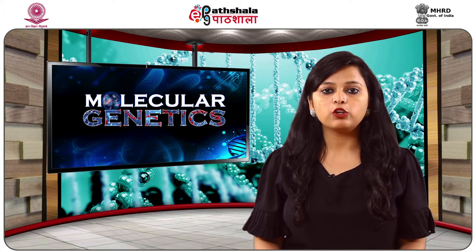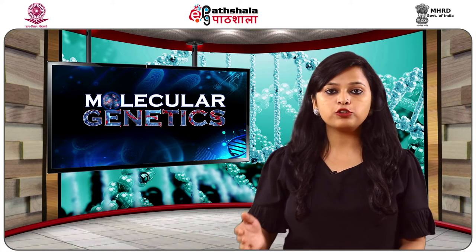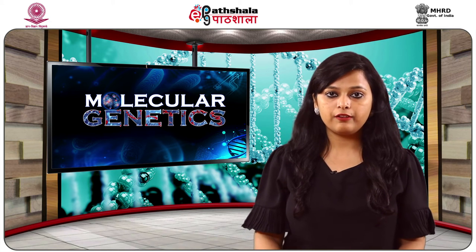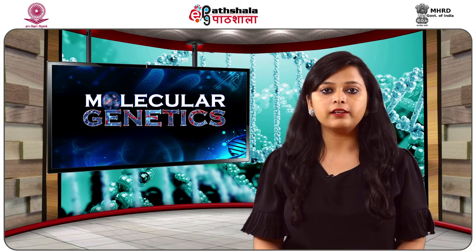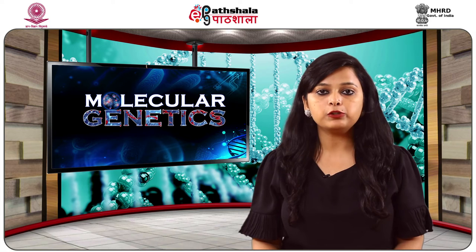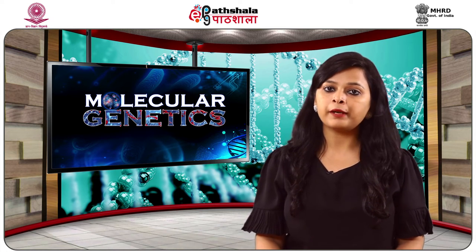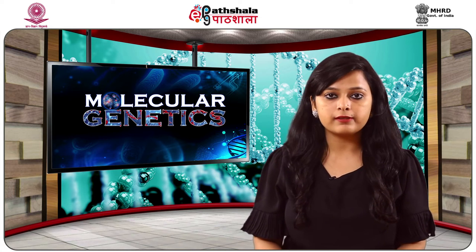For the purpose of immobilizing single-stranded DNA on membranes, high salt conditions, like more than 1 molar NaCl, are required. Finally, the membrane is heated at 80 degrees centigrade in a vacuum to permanently attach the single-stranded DNA. Under varying salt concentrations, all the nylon membranes are able to bind nucleic acids, and an irreversible attachment can be accomplished by UV irradiation for 3 to 5 minutes.